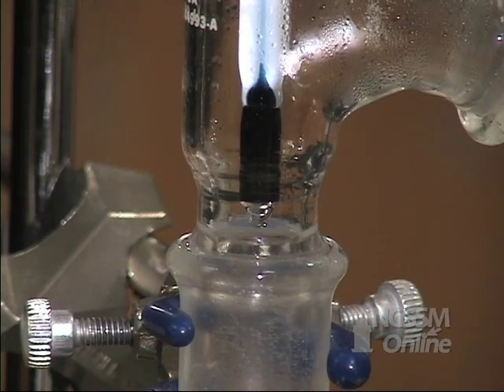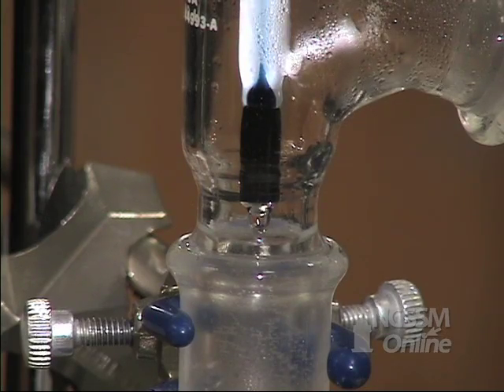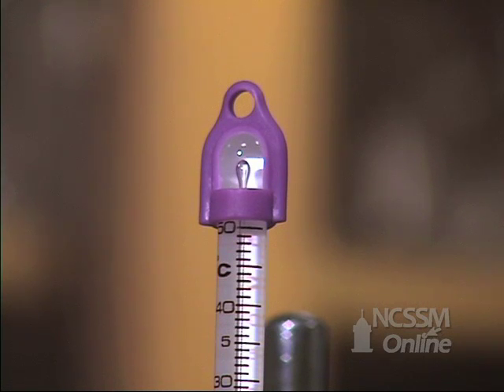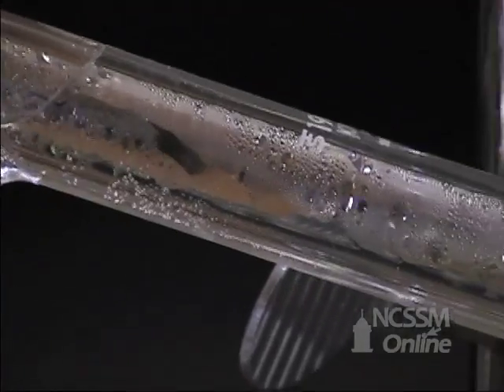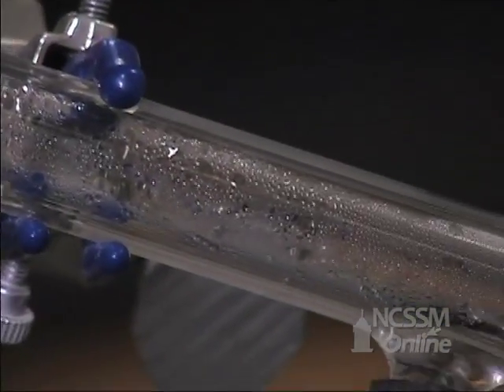Since the thermometer is in the interface between the liquid and the vapor, the thermometer reads the boiling point of the methanol, which is 65 degrees Celsius. The vapor then travels over into the condenser and is cooled by a stream of water and condenses from the vapor back to the liquid.